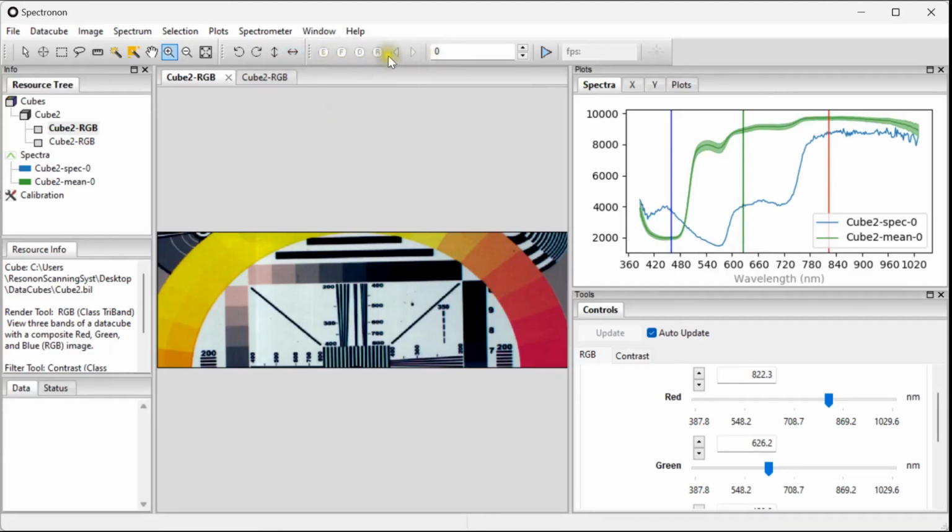The right end of the toolbar is used for data acquisition purposes and will be grayed out unless an imager is connected to the computer. These buttons are used to access the focusing modes, choosing an appropriate integration time, recording dark and white references, and choosing the number of line scans as well as initiating a new scan. Please see the quick start video for more information about what those panels look like.